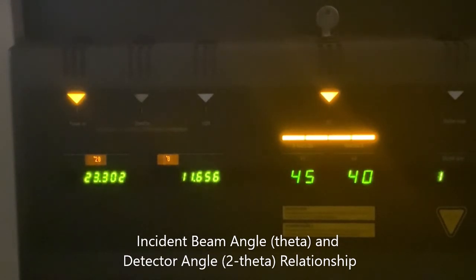Now we will show you the display of the front panel of the XRD unit to show you the changing positions of theta and 2 theta. The display also shows you the X-ray beam is turned on at an accelerating voltage of 45 kV. That again is the electrical potential between the cathode, the wire tungsten filament, and the copper target or anode. The current running through the filament is shown here as 40 milliamps. The combination of the accelerating voltage and the filament current define the number of X-rays being produced.